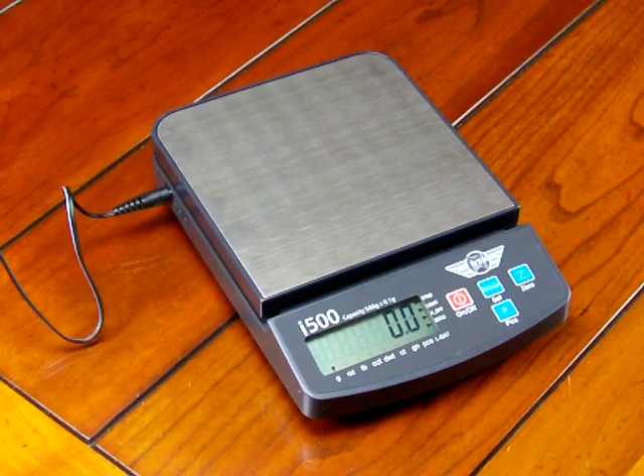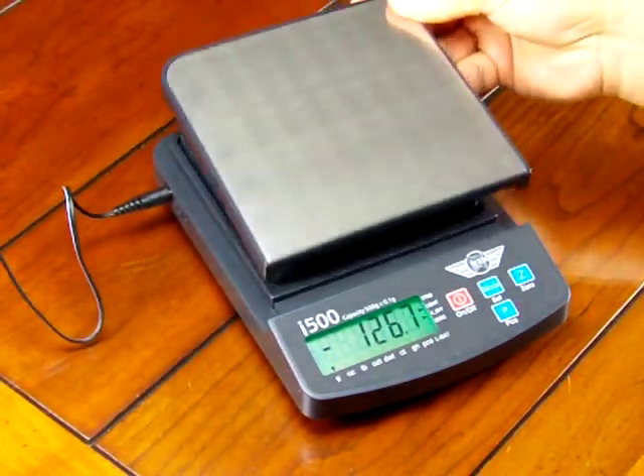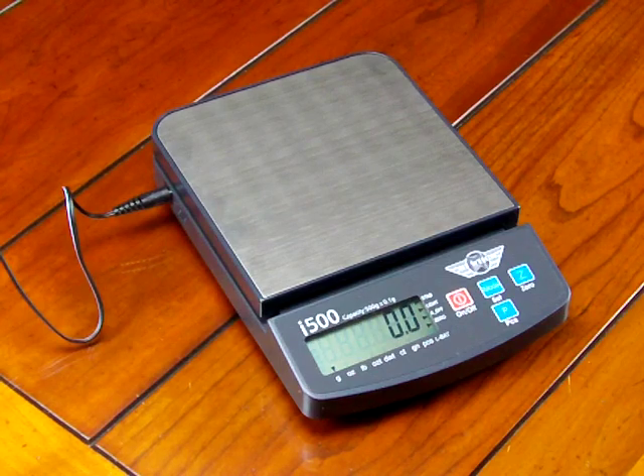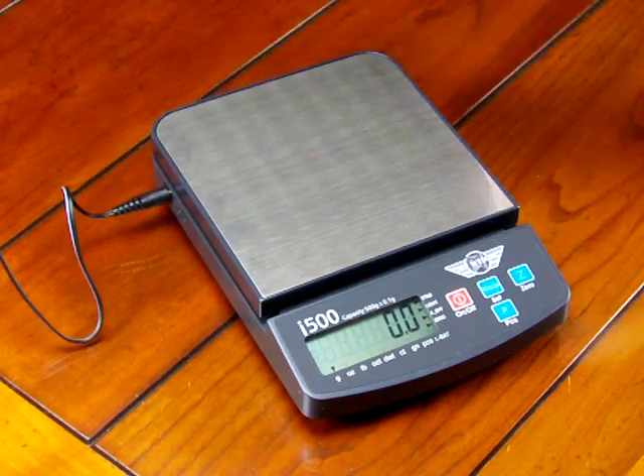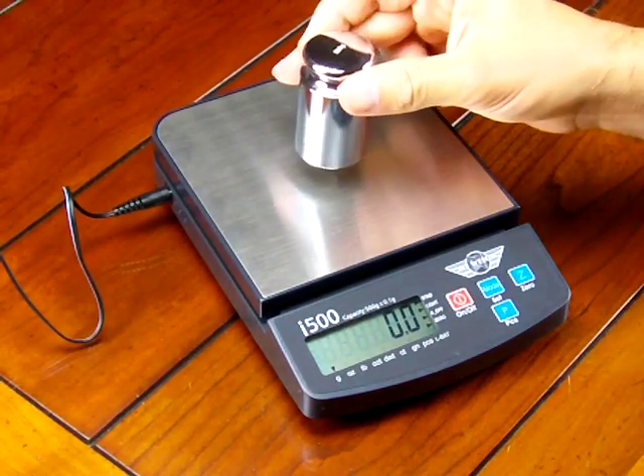A lot of manufacturers in this price range do not include the AC adapter. So this is our demonstration of the MyWay i500. We are an authorized MyWay dealer and always have these in stock. It's an extremely affordable scale — a lot of schools are buying these. The scale has a nice stainless steel platform that is removable for easy cleaning, and multiple weight modes. We highly recommend purchasing the calibration weight — a 500 gram calibration weight, which we sell at balances.com as an optional accessory.